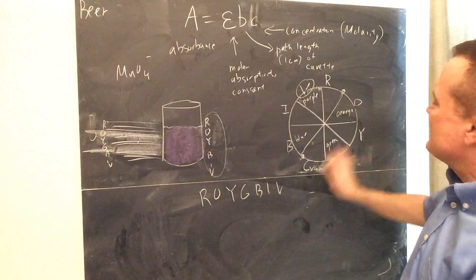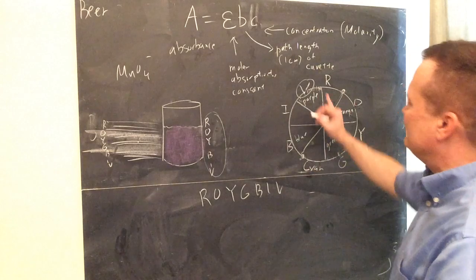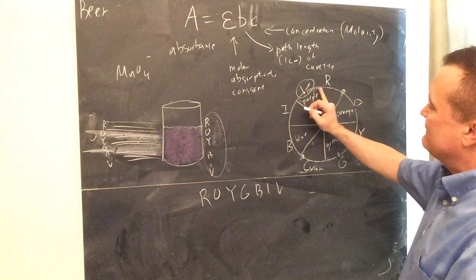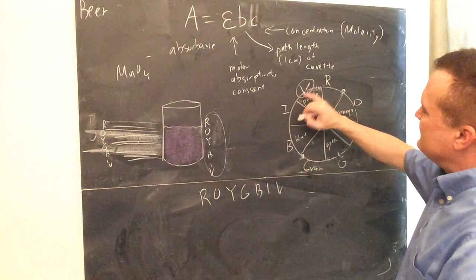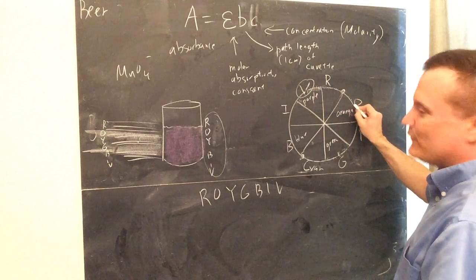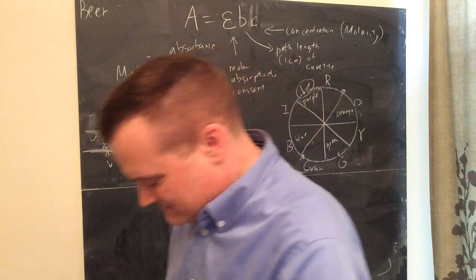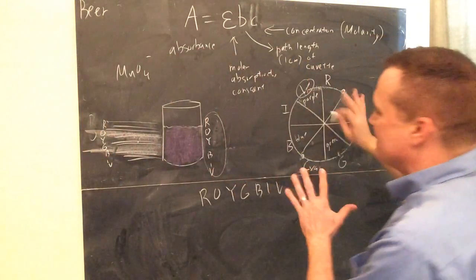So this is not a perfect color wheel. To be perfect, you'd have to have the exact number of the wavelength. There's many different numbers along here for different kinds of red. Brick red, dark red, orange red, and all that. So okay, this is just to give you an estimation right here. All right.